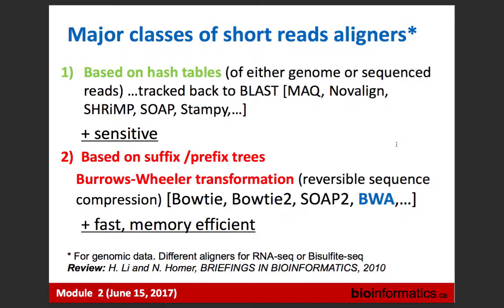Well, it's, of course, computationally rather involved because we have to traverse a huge table, right? We have four possible letters in every position of the human genome. If we have dinucleotides, we have 16 different dinucleotides. If we have three nucleotides, we have 4^3. And if we have 30, we will have 4^30, which is a pretty big dictionary to traverse, okay?